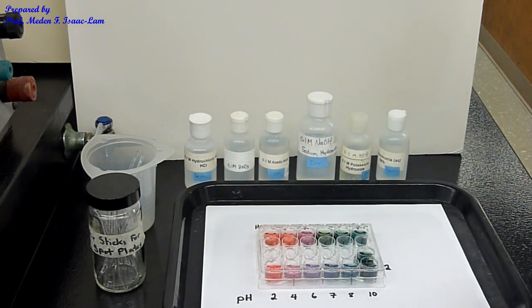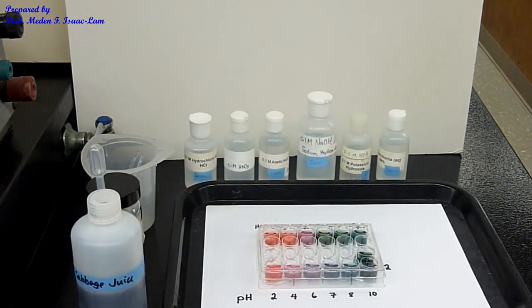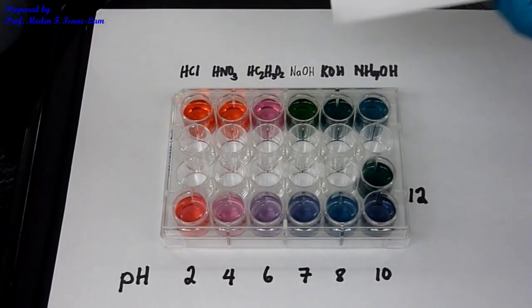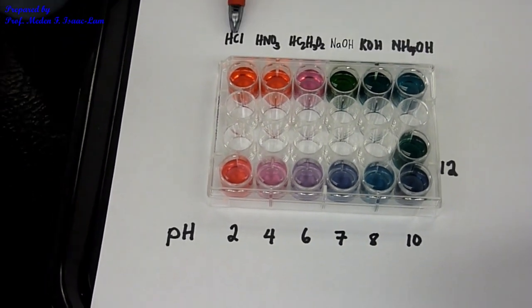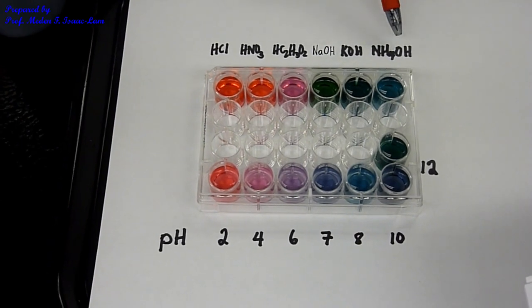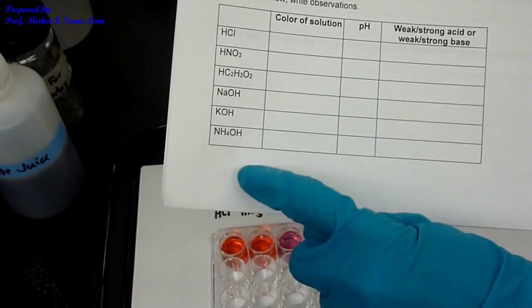Okay, so now let's review. So we have all the six solutions. You're going to compare the color. We are now filling up this table. Again, the first one is hydrochloric acid, nitric acid, acetic acid, sodium hydroxide, potassium hydroxide, ammonium hydroxide, exactly how I listed it here in this table.